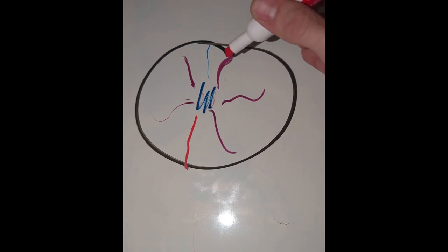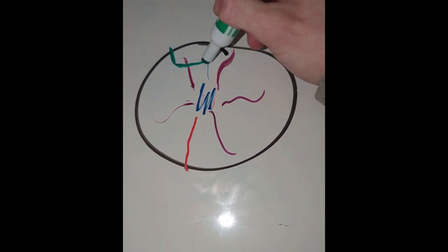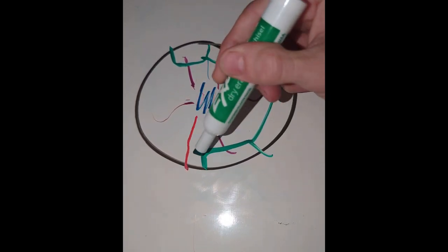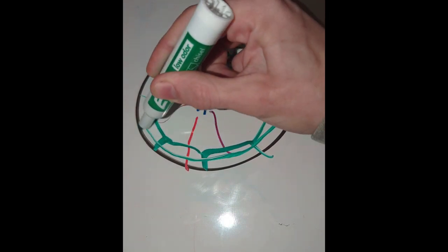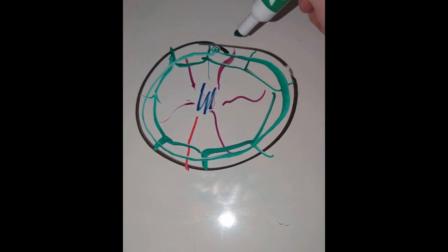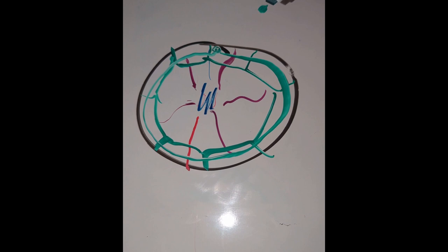One thing I've done when transferring off of germ plates is I'll use as much of it as possible. So I'll take a transfer from here, here, here, here, and here, and just pretty much try to obtain all that. Another thing I've done is get a scalpel and drag the mycelium from all around the plate, pick up that which contains all of that, and then transfer it in a single location to another petri dish. Or I'll even just transfer it into a liquid culture.